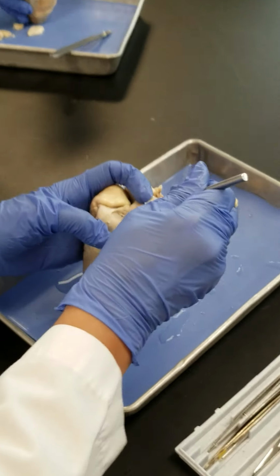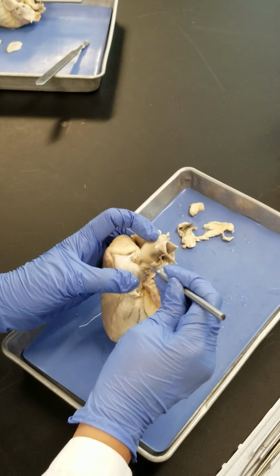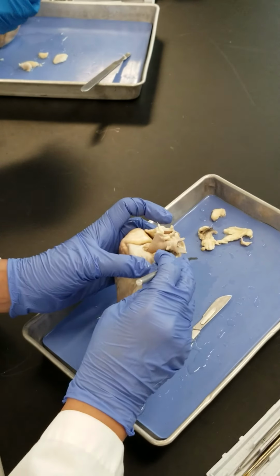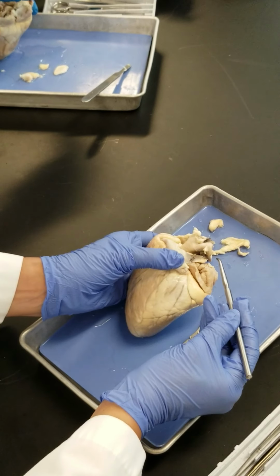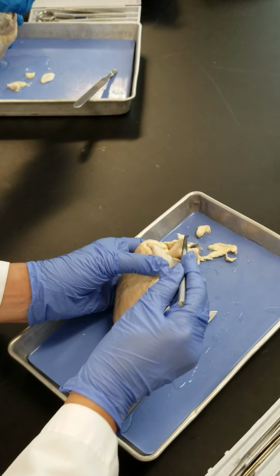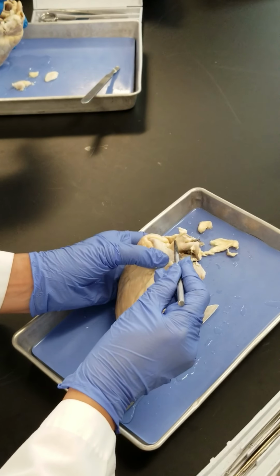Now for the aorta, first we have the ascending part that is deep over there. If we continue and dig more, you would be able to see that, but we don't want to cut them all completely separate. So after the ascending, you have the arch of the aorta, and then if it was continuing, you could see the descending aorta. But it has been cut here, right? This is the arch of the aorta, as you see here, it has been cut here. So you have only one branch from the arch of the aorta that you see here. What is the first branch on the arch of the aorta? Brachiocephalic trunk. Brachiocephalic trunk, this one, right?